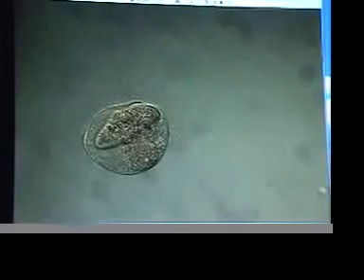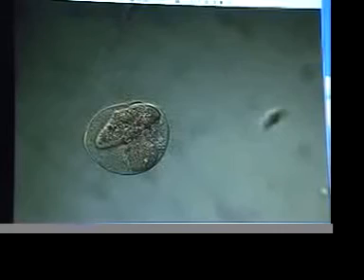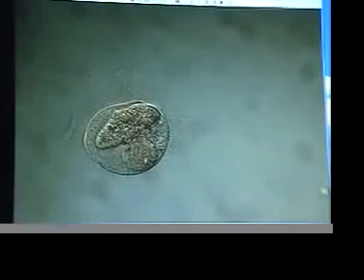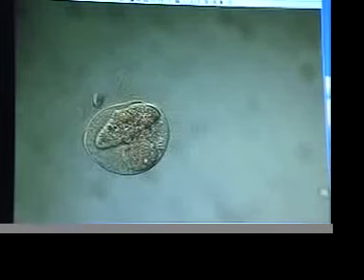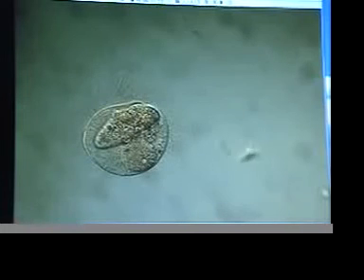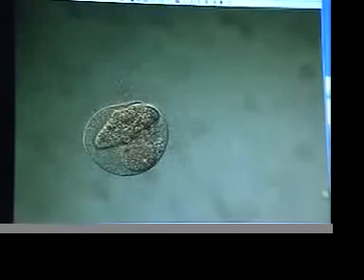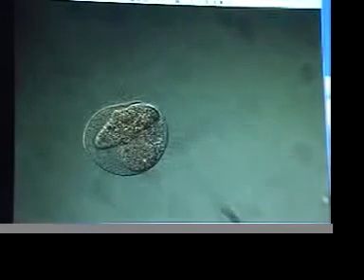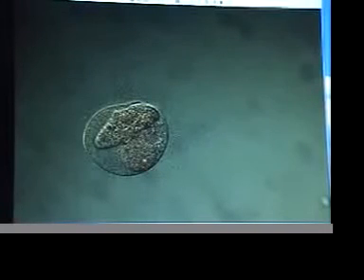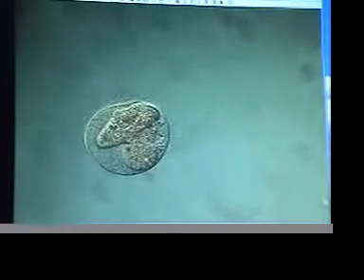Morphological transformation of a Paramecium caudatum as seen through an Olympus VX60 research microscope with a Nomarski DIC differential interference contrast filter. We continue to see internal changes in the organism. Let's continue to adjust the DIC filter, which reveals some of the subtle textural changes.